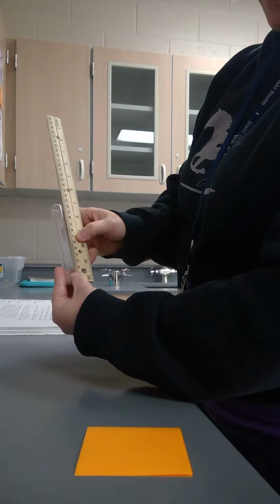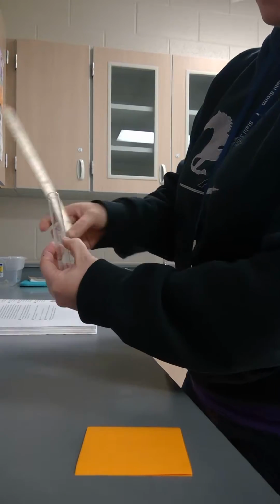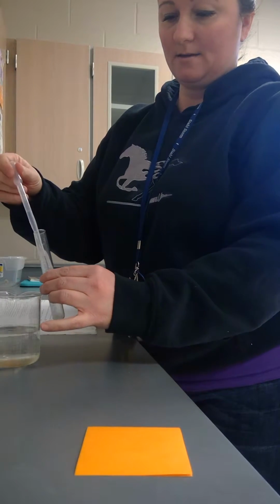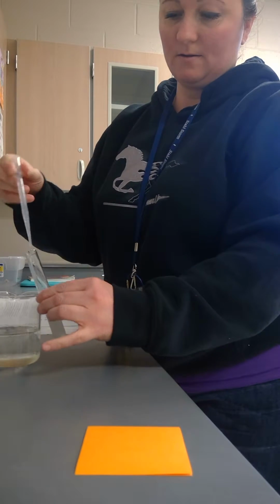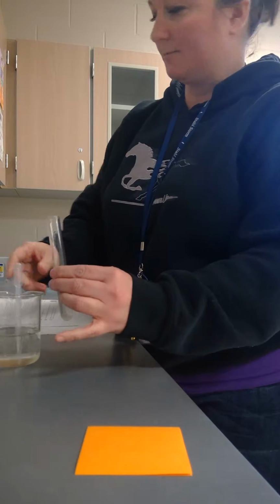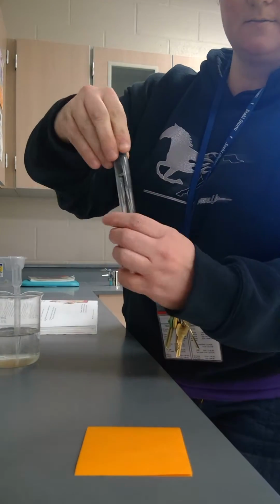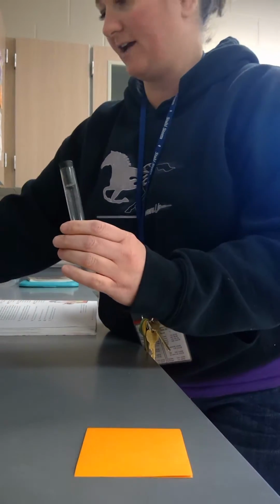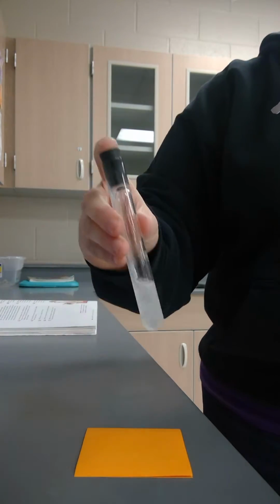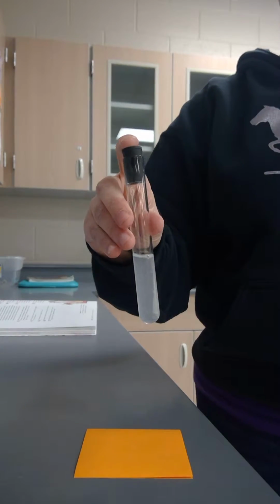Then I'm going to place about 5 centimeters of water. So I'm going to measure up the tube. I'm going to bring my water to about that level right there. Again, this is just plain water mixing together. Nothing fancy about this water. NaCl, or sodium chloride. Do you remember what that's called? Salt. It's just good old-fashioned salt. Now the directions say to mix this exactly 10 times. So 1, 2, 3, 4, 5, 6, 7, 8, 9, 10.